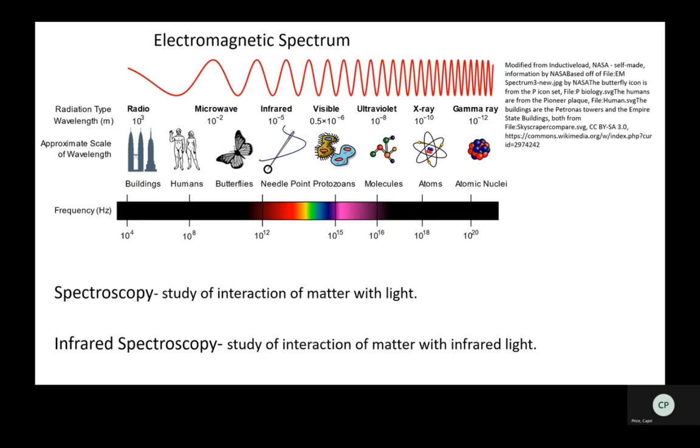So what do I mean when I say infrared spectroscopy? Well, let's start with the first word, infrared. So you've probably seen an electromagnetic spectrum before. I like this diagram that I've seen floating around the internet. So we have all different kinds of light with different lengths of waves. On the short wavelength, high energy end of things, we have X-ray light, which we talked about using with X-ray fluorescence and studying historical sites.